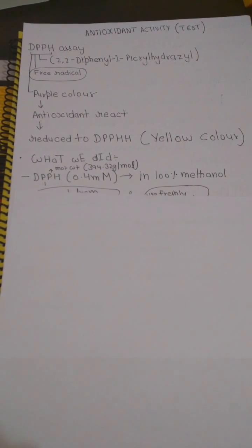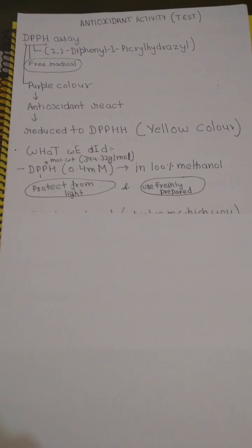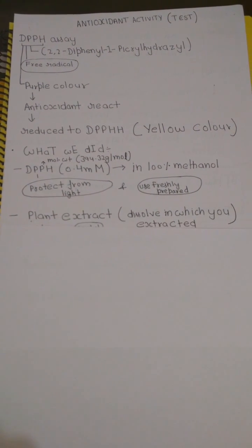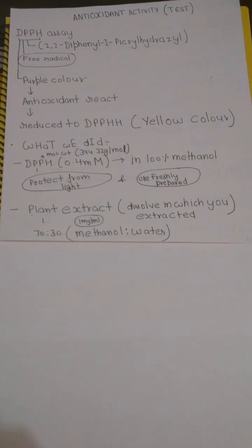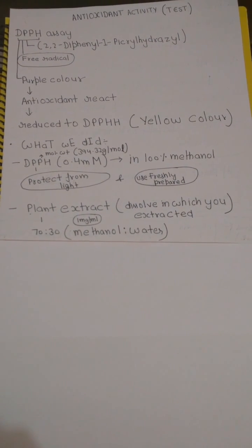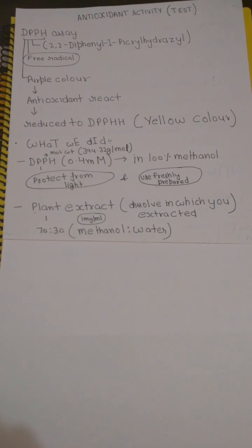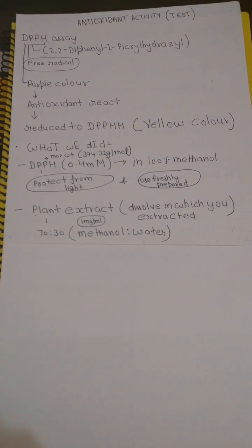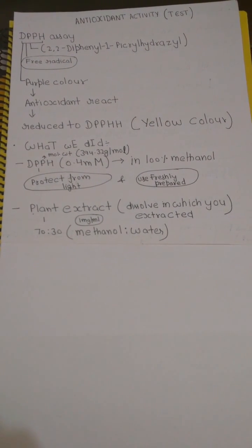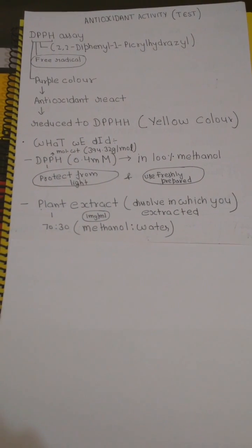Now let's talk about the protocol. First of all, the things that you need: of course DPPH. We prepared 0.4 millimolar DPPH in 100% methanol. Make sure to protect it from light and always use freshly prepared DPPH. The second thing that you will need is plant extract. We prepared 1 mg per ml concentration of plant extract in 70 to 30 ratio of methanol and water.